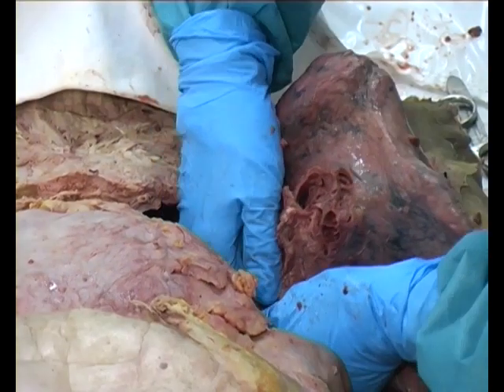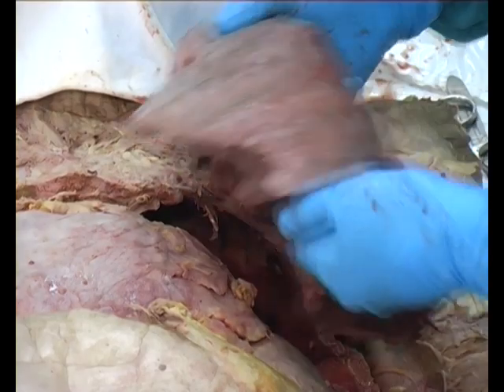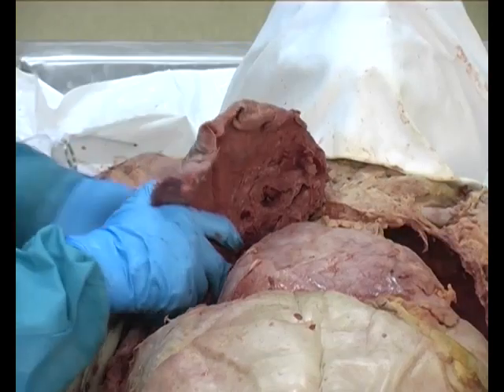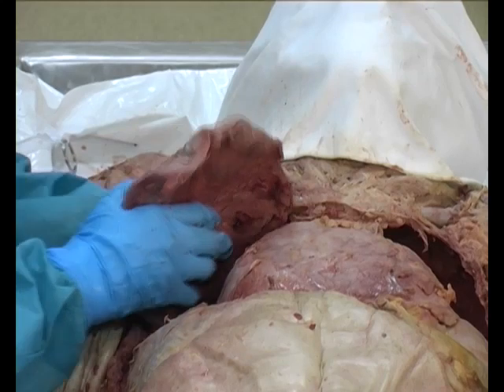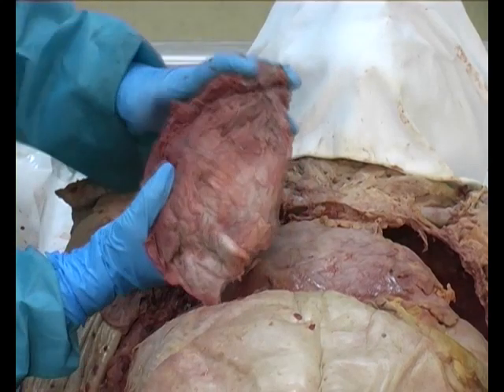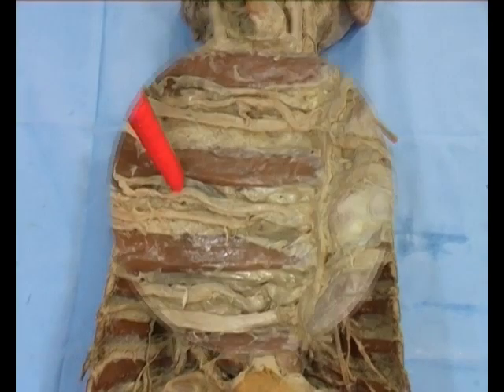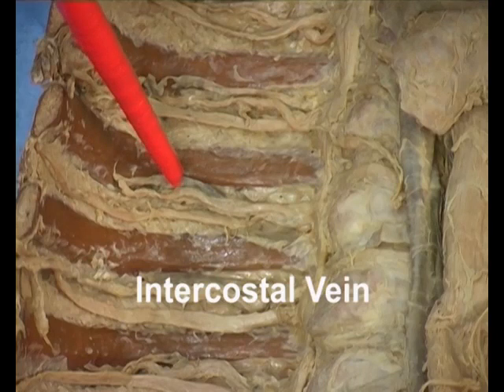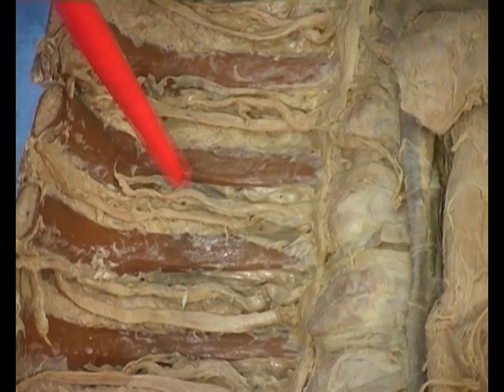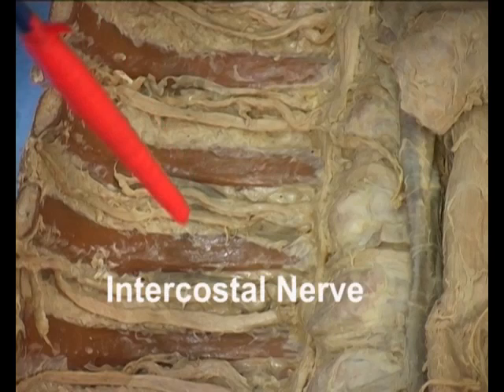Now bluntly dissect out the lungs with your hands. Once you have freed them as much as possible, incise the lungs at the hilum. Remove the lungs from the thoracic cavity. With the lungs now out of the way, dissect out the intercostal vein, the intercostal artery, and the intercostal nerve and the posterior chest wall.